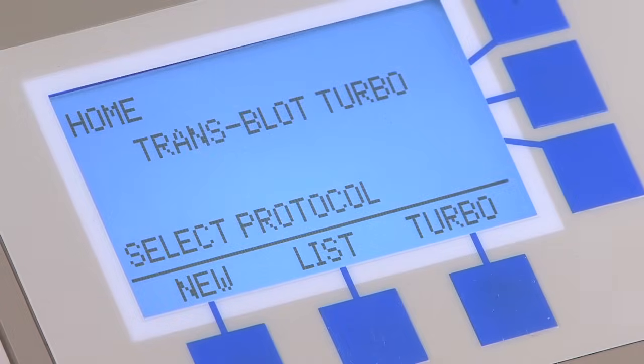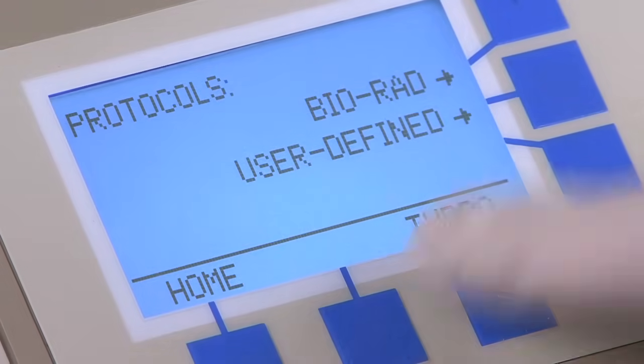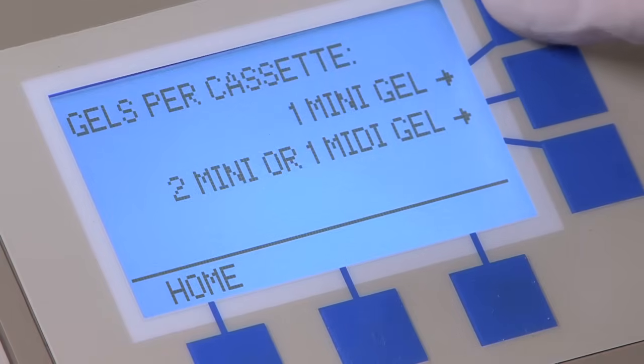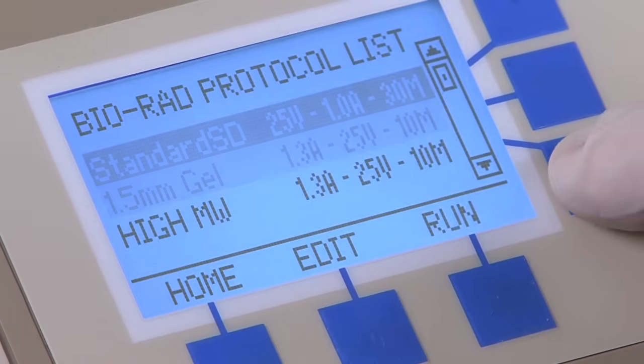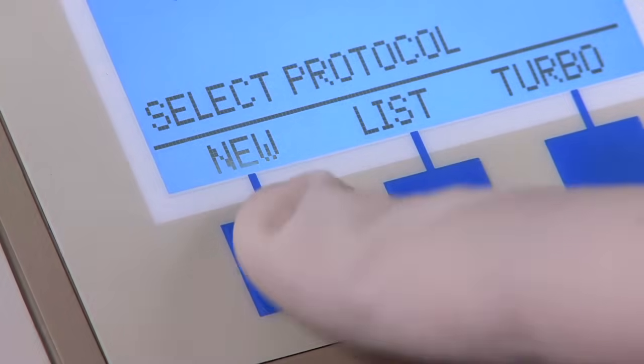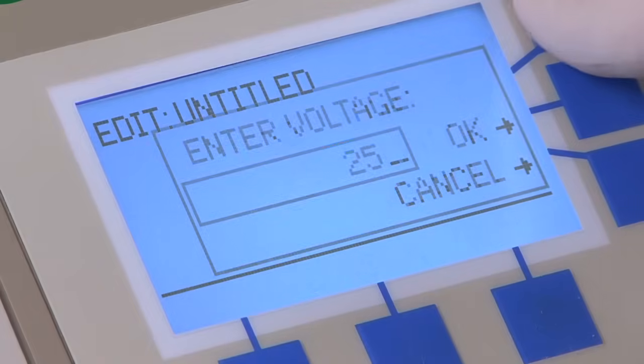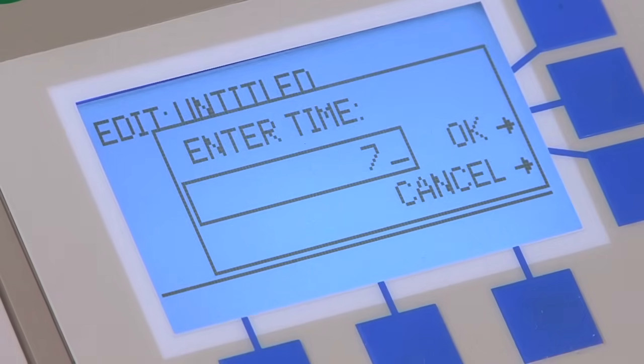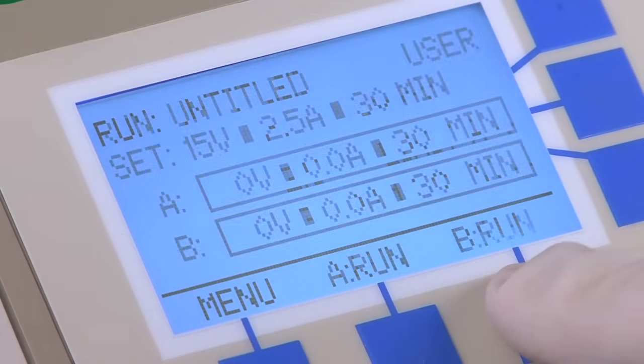The trans-blot turbo system comes preloaded with several protocols for transferring a wide range of proteins from any gel type. In addition to the preinstalled protocols, you can also program and save your own transfer conditions. By varying the voltage, current, and time, you can customize the trans-blot turbo for your own specific needs.